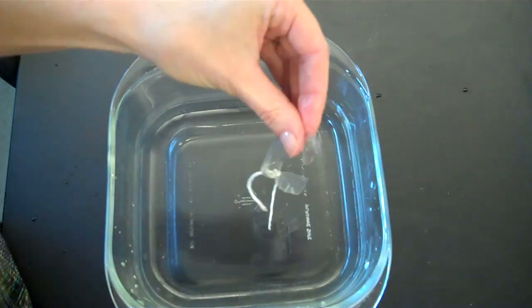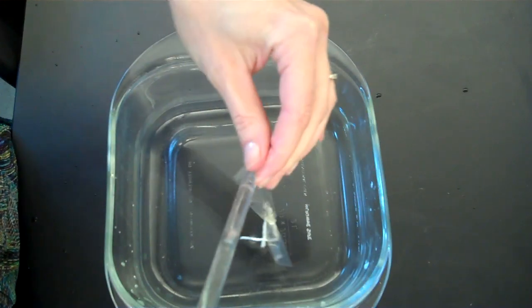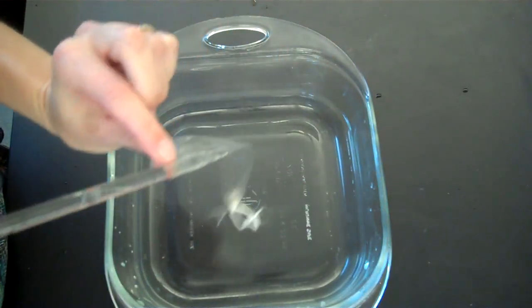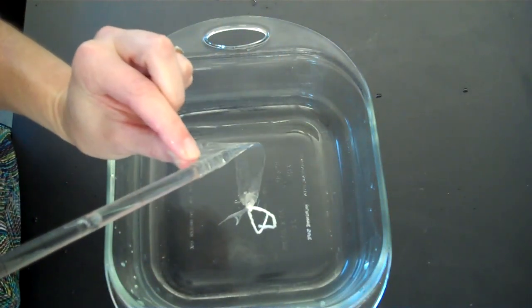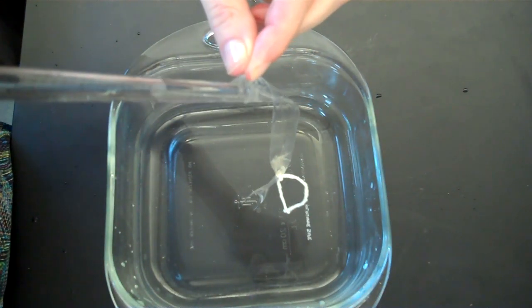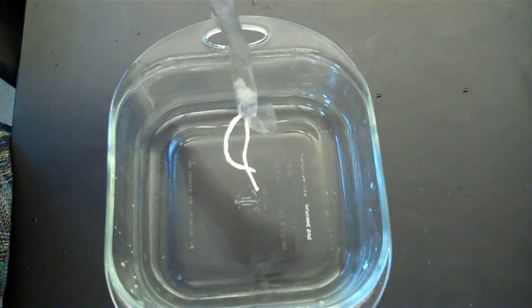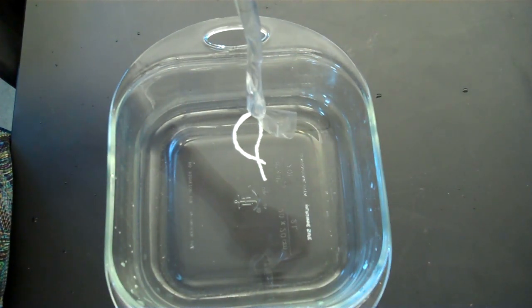And once it's opened up, you take your serological pipette containing the liquid, put it inside. Let's see if you can see this. And slowly fill the tube.